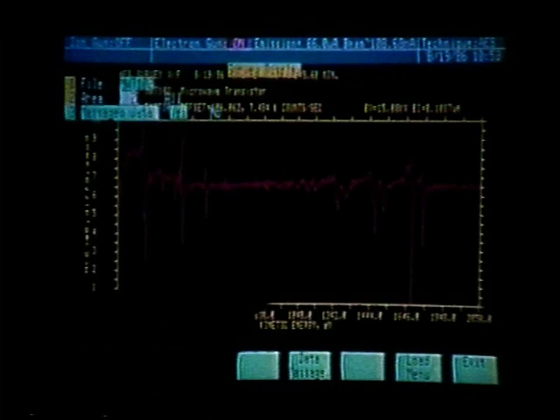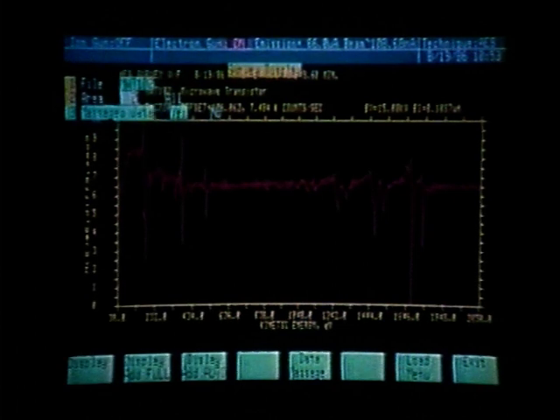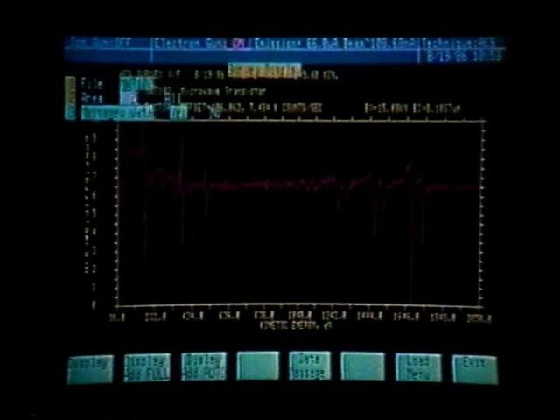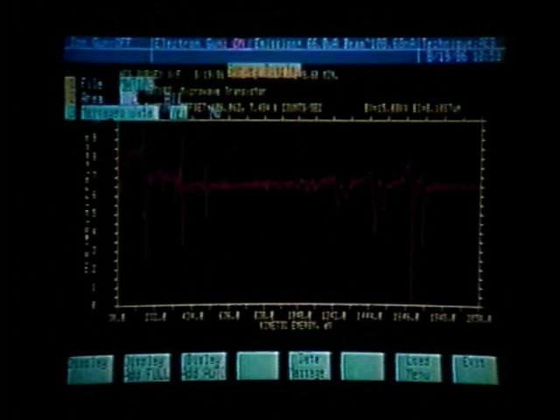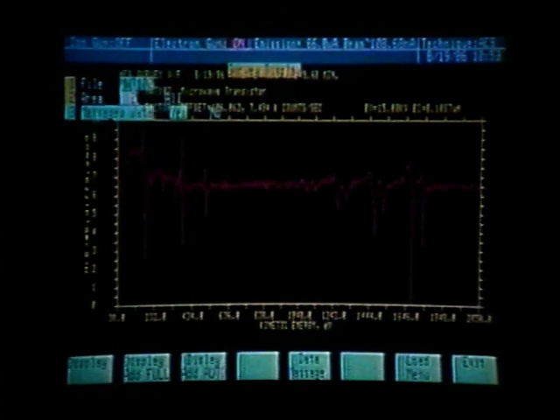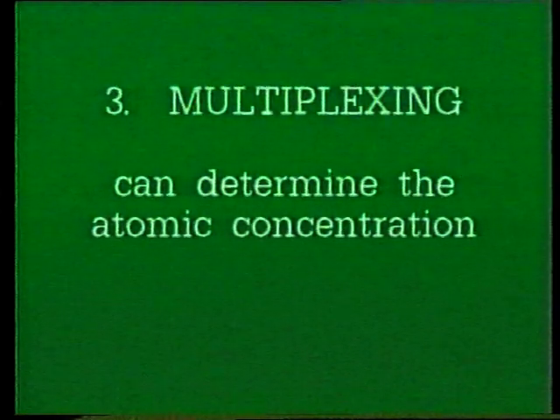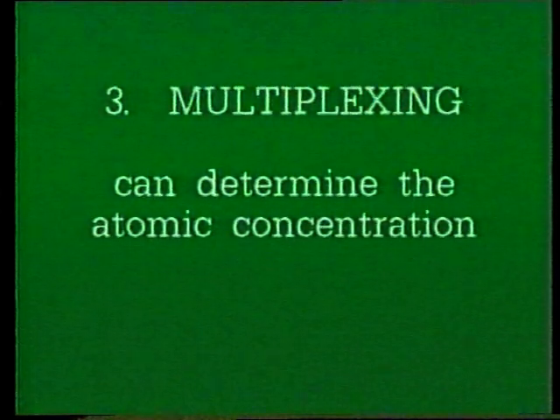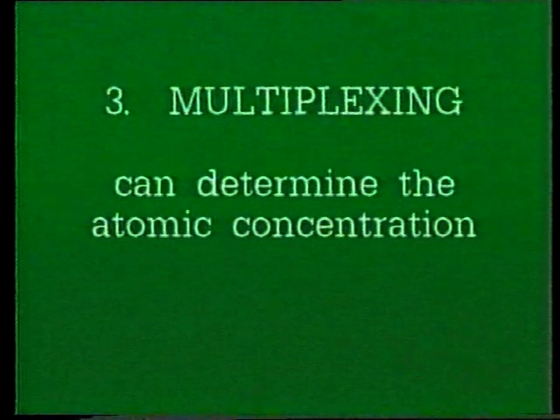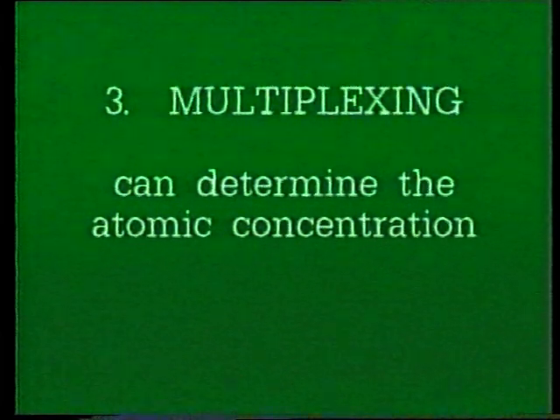We can also use multiplexing to more accurately define the peak, the exact position of the peak, and the peak structure. What we are using here is one volt per step. We could change the volts per step in a multiplex routine and take several data points per electron volt, which would give us better peak definition. The third use for a multiplex, which we will demonstrate here, is to determine the atomic concentration.